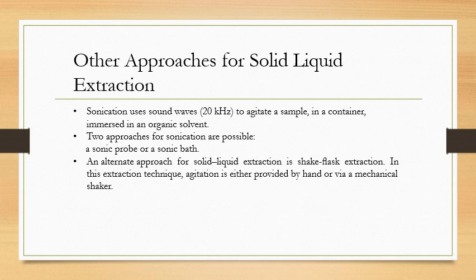Other approaches for solid-liquid extraction. The first one is sonication. It uses sound waves of 20 kilohertz to agitate a sample in a container immersed in an organic solvent. Two approaches for sonication are possible: first, a sonic probe, or a sonic bath.